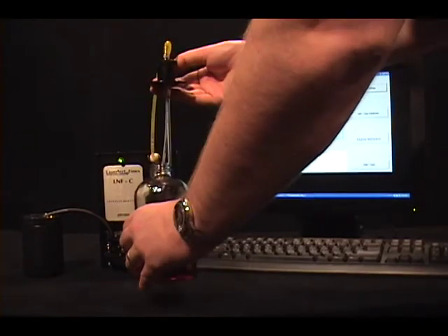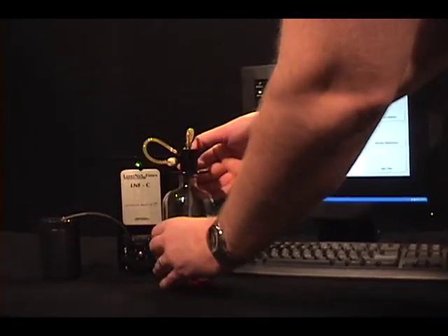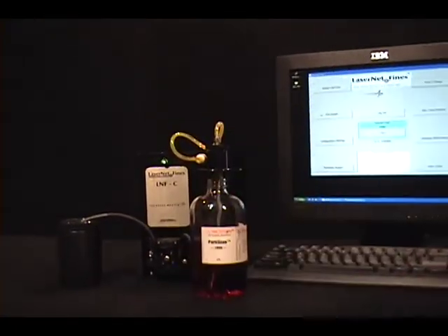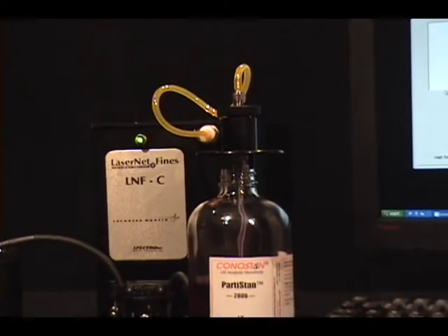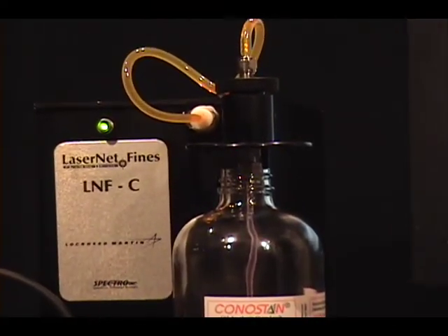After the sample has been properly prepared, it is introduced to the LNF at the sipper tube. Start test is selected from the main menu of the software. This starts the pump and the sample is pulled up through the sipper tube as it makes its way to the flow cell.